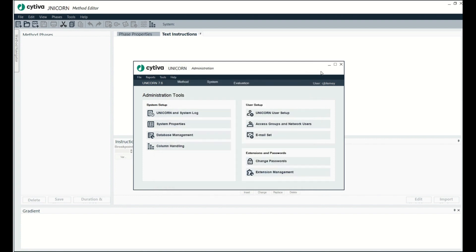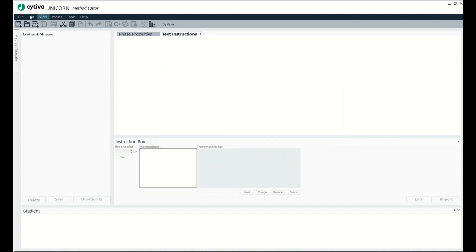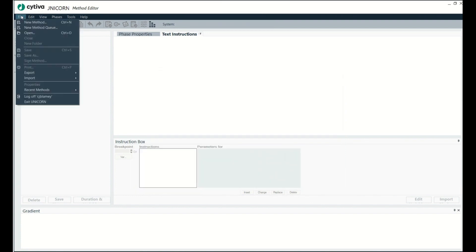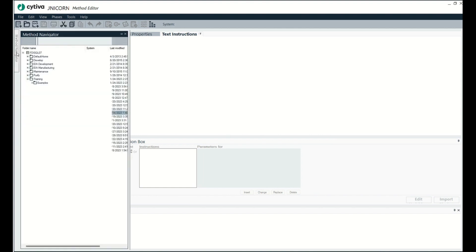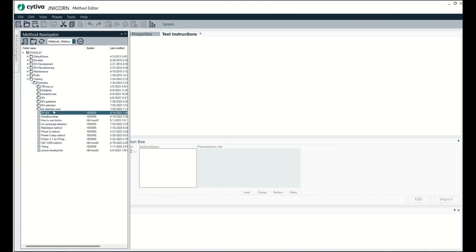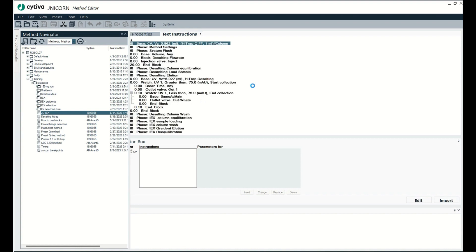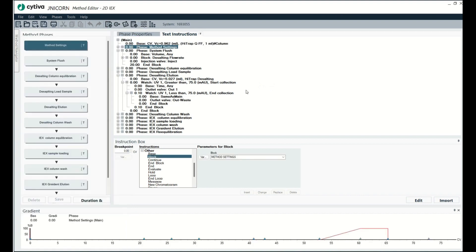So let's go open it. Let's see here. Method editor. Open. Okay, there we go. It's unlocked. It's just that easy.